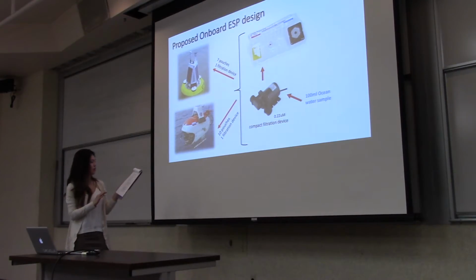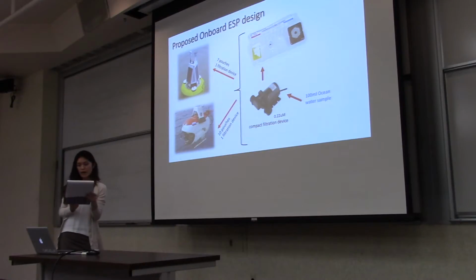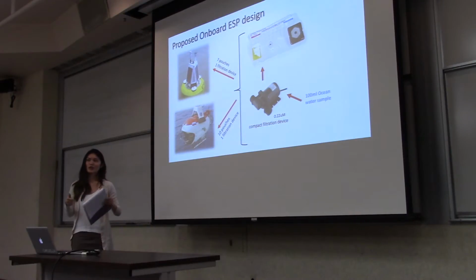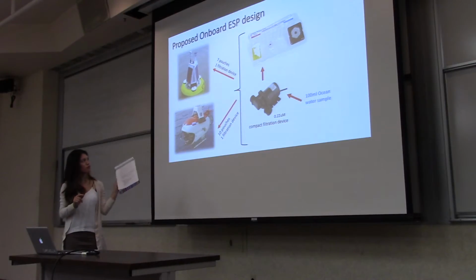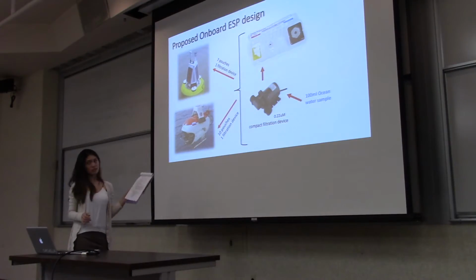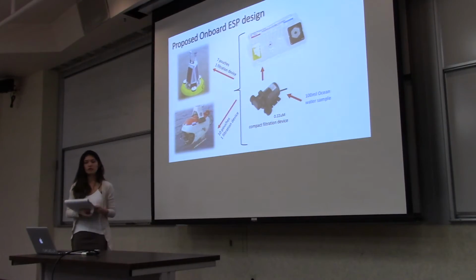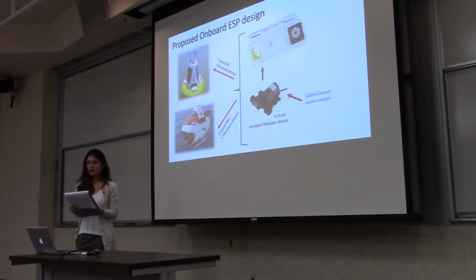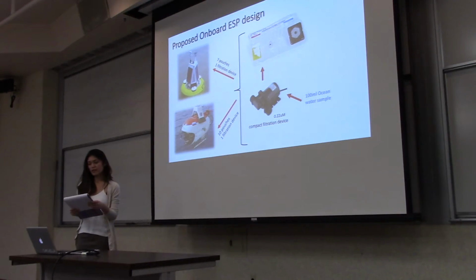The NOAA Ocean Explorer based ESP will include 10 pouches per unit, and it will be kind of like a rover type, so you can control it from a remote area, and you don't have to be at the location. We want the mobile one to circulate the area to tell us the best places to drop the buoys. And you can retrieve the data from the PCR via USB. Also, the buoy type of ESP is going to be solar powered, and you can collect the data via Wi-Fi. Each unit will include 7 pouches, 1 test a day for a whole entire week.